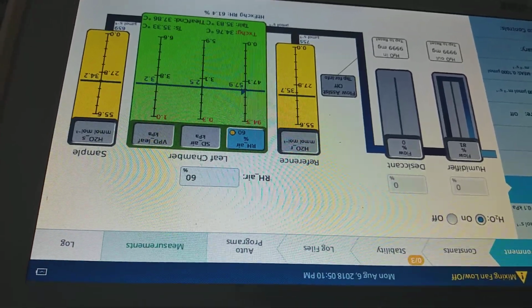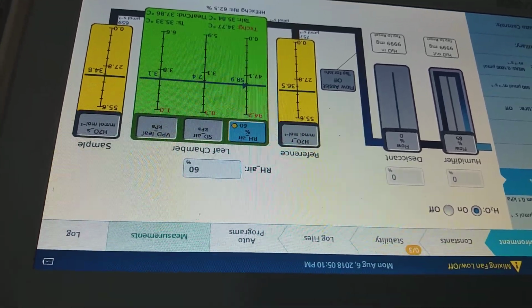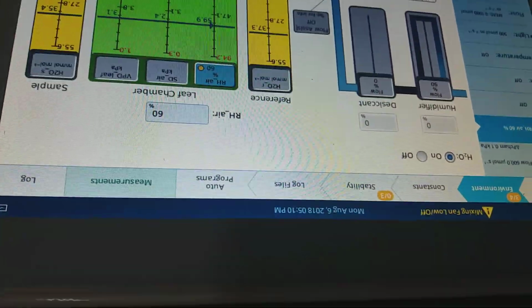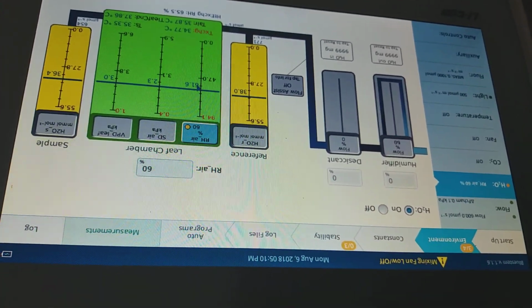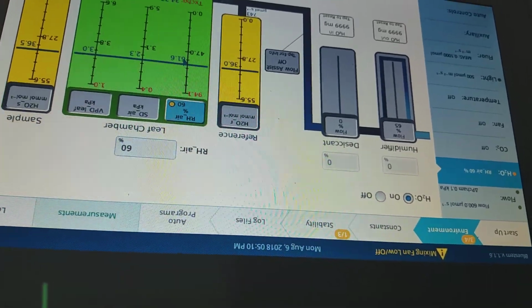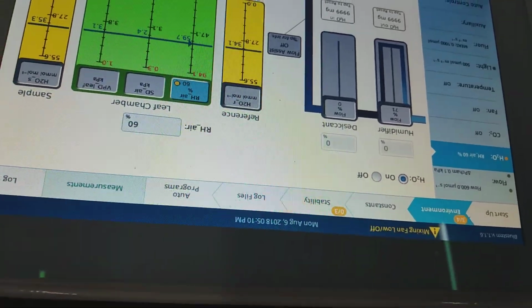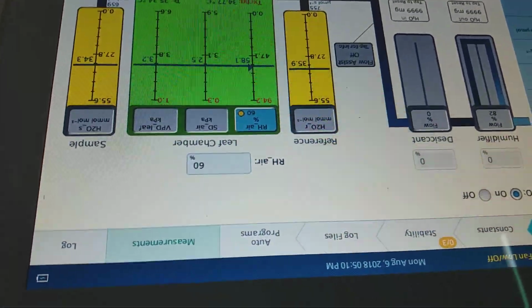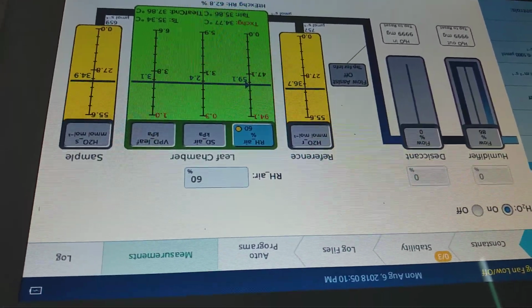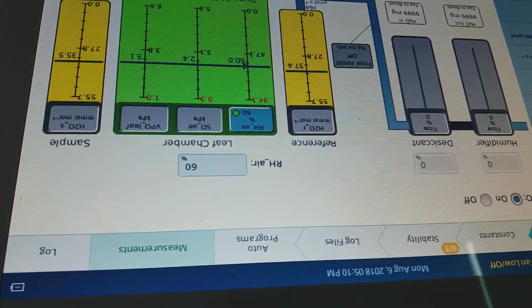If you turn it on, I mean, it's going to be completely bypassed. If you remember from the 6400, there's a scrub and bypass. So you just need to familiarize yourself with slightly new terminologies now.